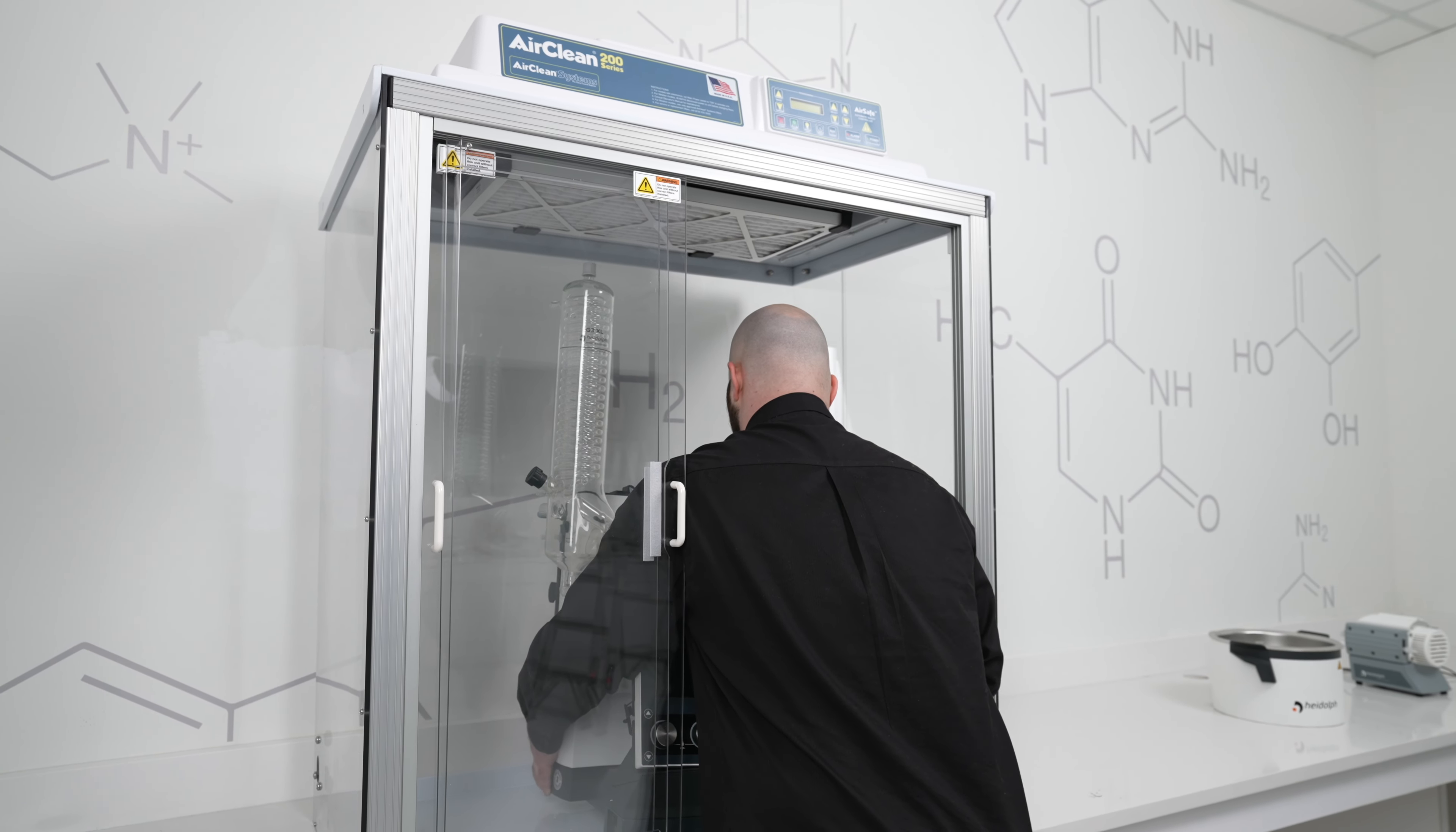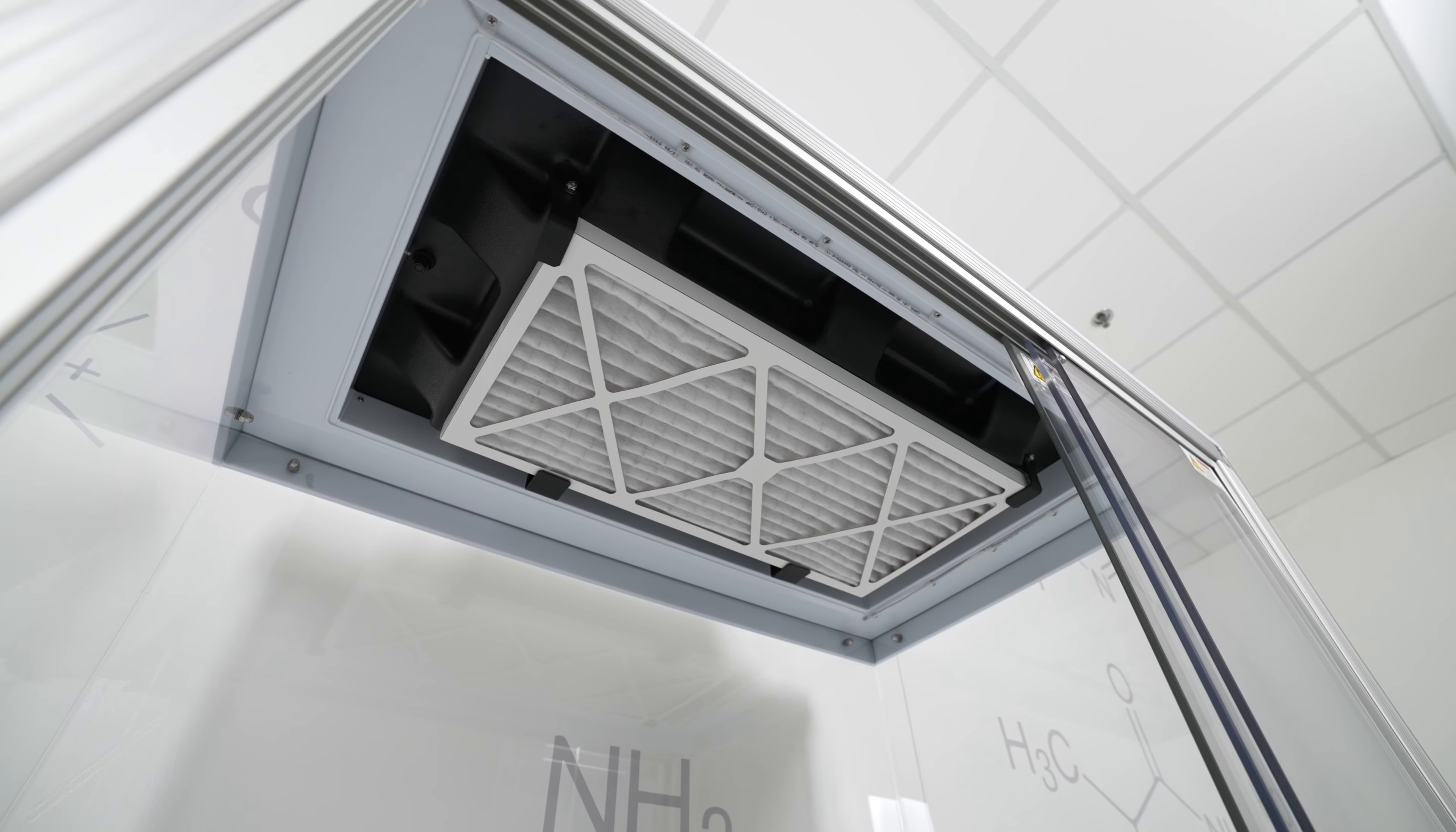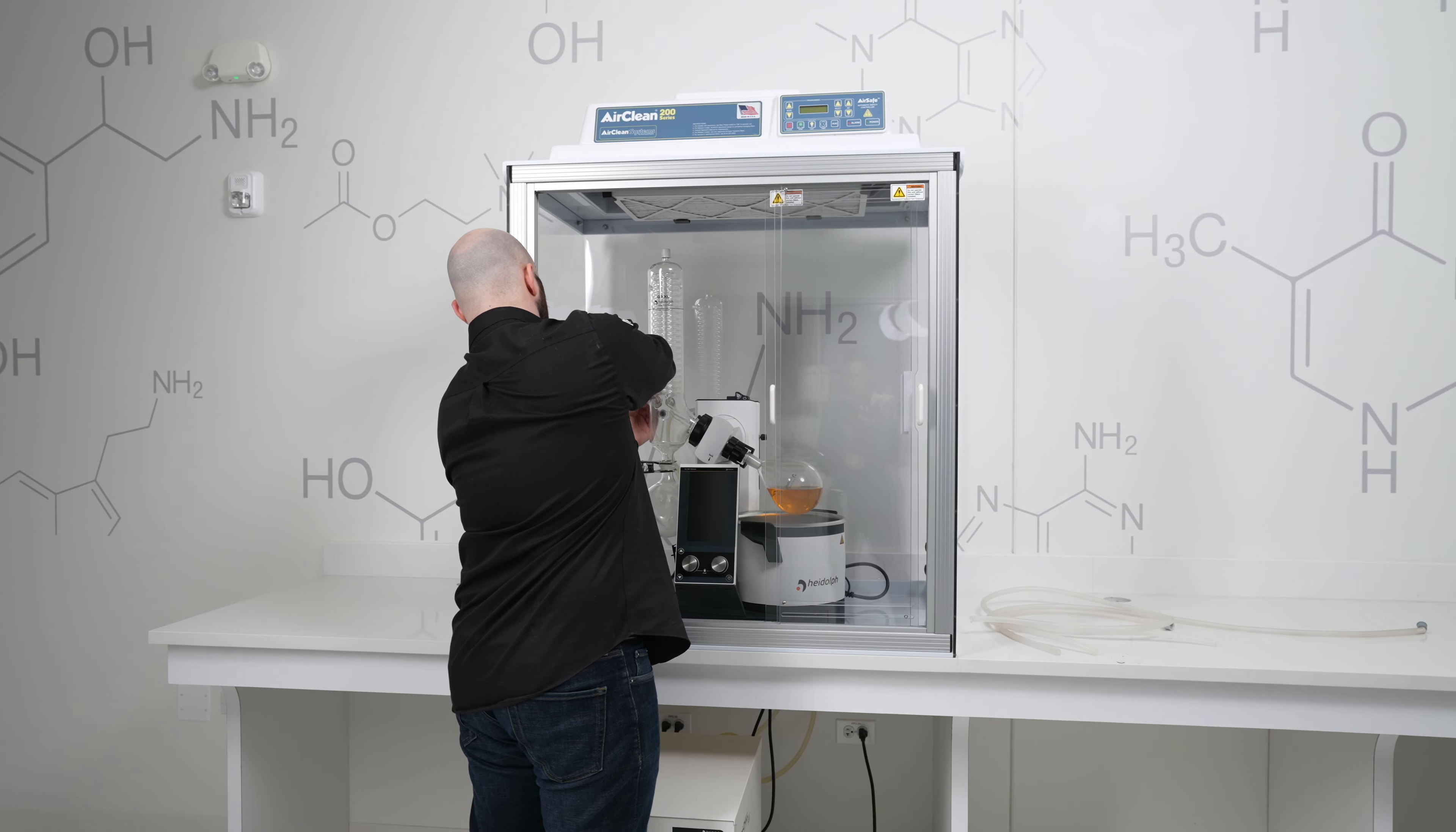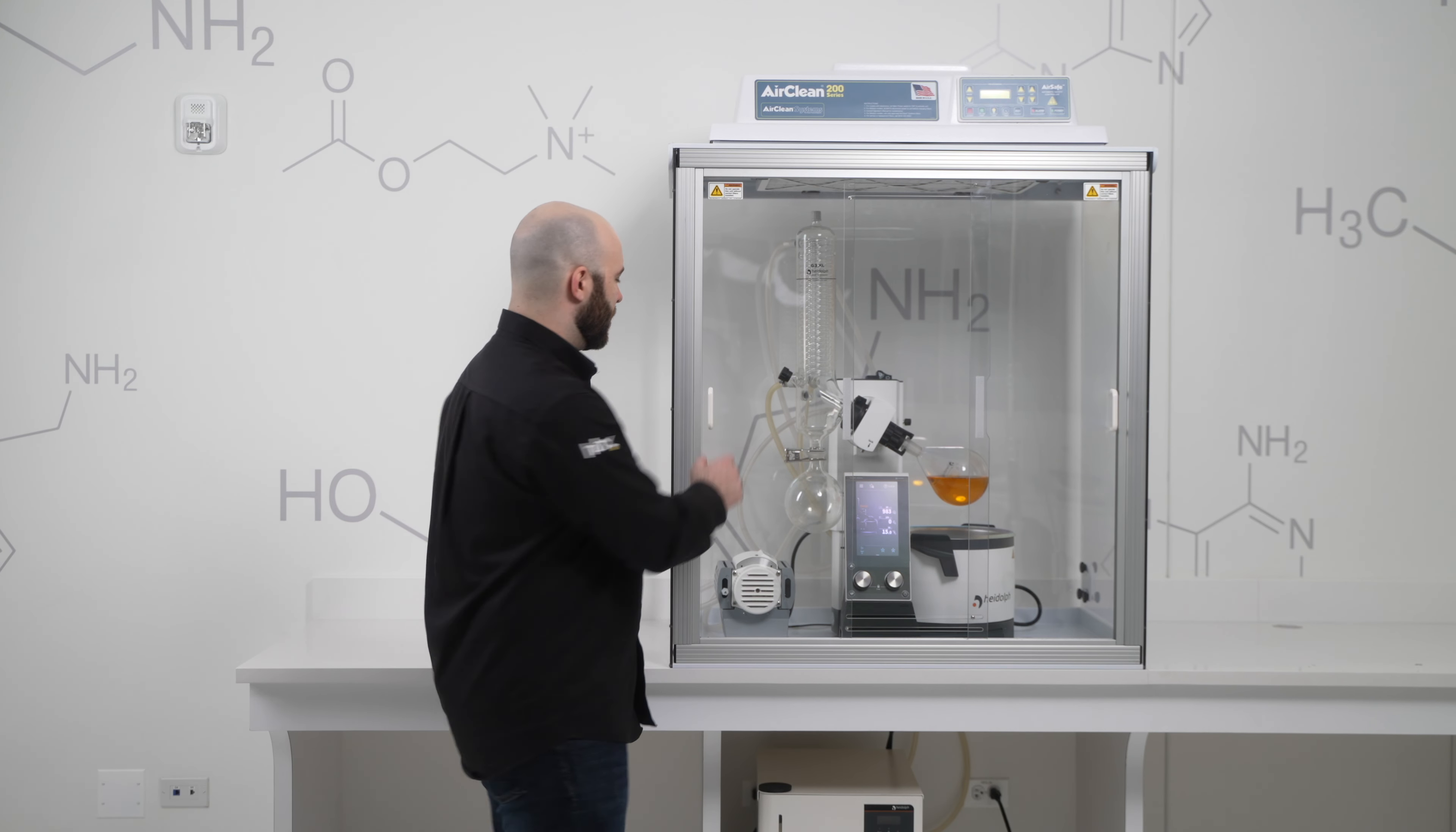Well, we can get around that with a fume hood. And in our case, what I have here is the air clean ductless enclosure. So the ductless means that you don't have to have ducting from your HVAC hooked up to your fume hood to remove all of that solvent vapor. It uses filters to filter that out. That gives it a much smaller footprint as well, so you can place it anywhere in your lab.